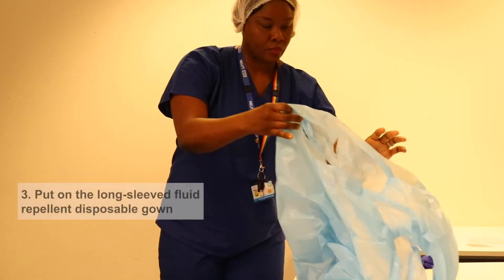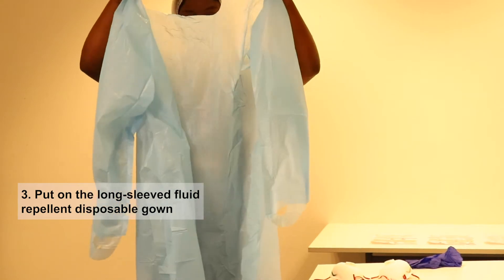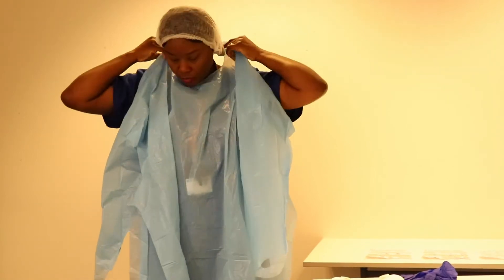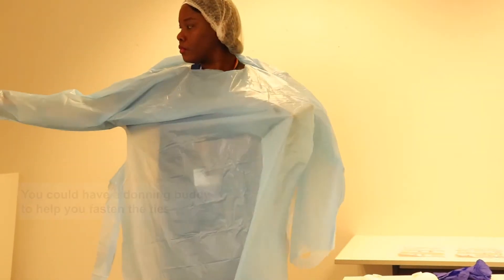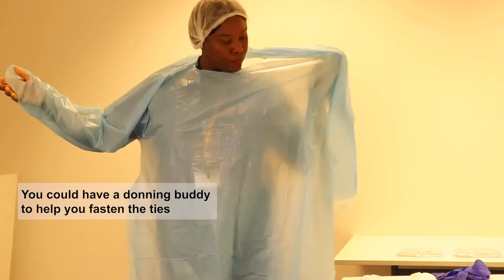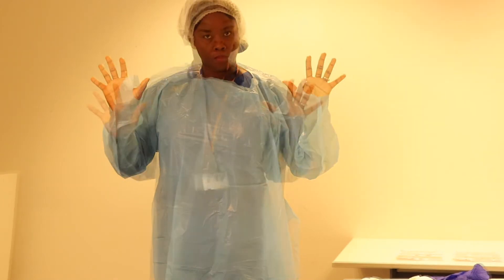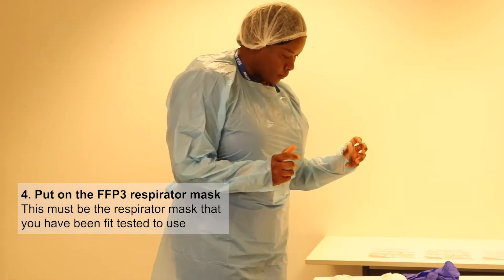Next you would put on your gown. There are several different types of gown but they're all roughly the same. This particular one goes over your head and has thumb holes for you to put your thumbs through. Someone can help you — a donning buddy can help tie it up at the back. We do have donning and doffing rooms on the wards.